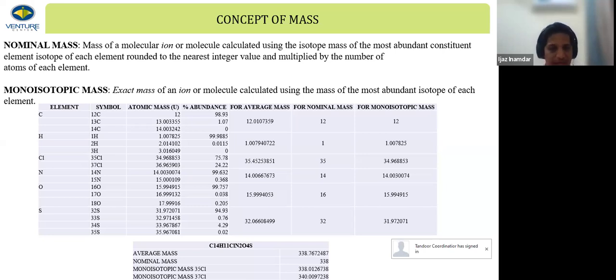For example, your synthesis team is working on a certain drug and they say that they have incorporated chlorine into it. They ask you to tell them whether the chlorine has been incorporated or not. So you inject the molecule into the system and see if you are getting two peaks separated by a two Dalton difference, with the intensity in the ratio of 10 to 3. And if you do get this, then you can say yes, one chlorine atom is there.